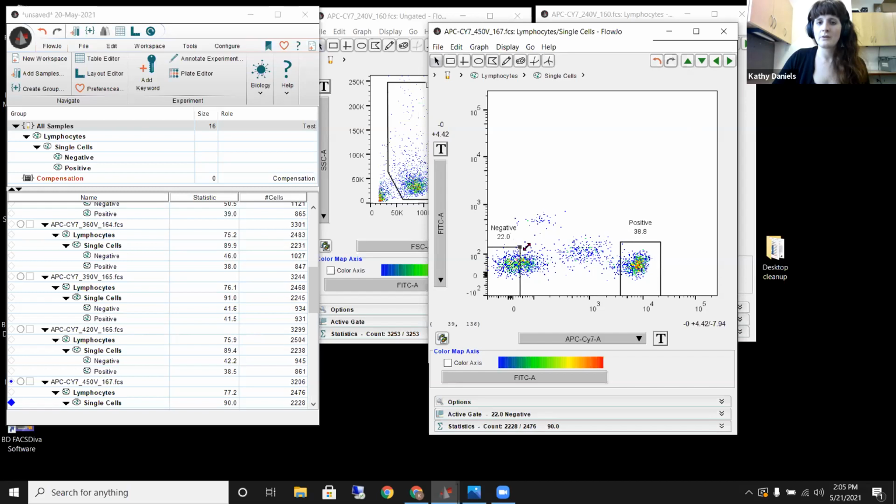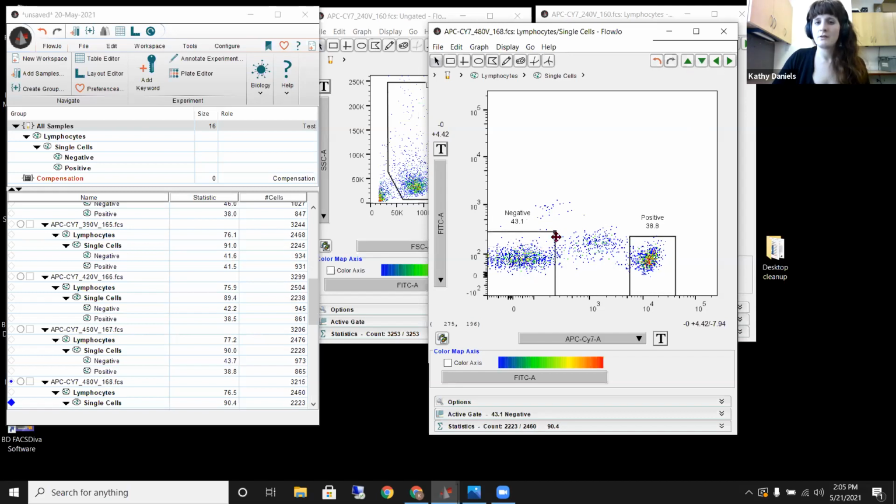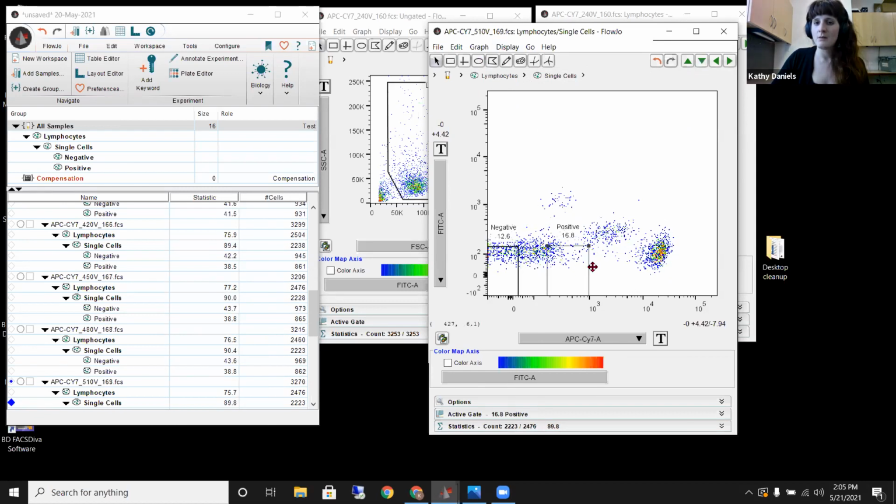Each one and pull out those populations of interest. Okay, now we could also explore the use of different gates, right? So we could explore the use of polygon gates, elliptical gates, or freeform, right? So we have those different options, but we're perfectly fine using this for this analysis today.